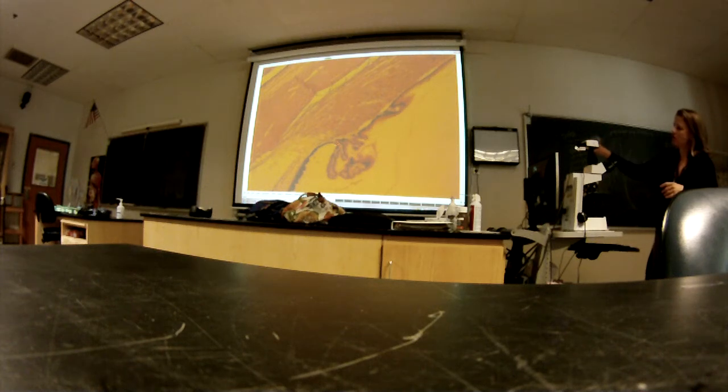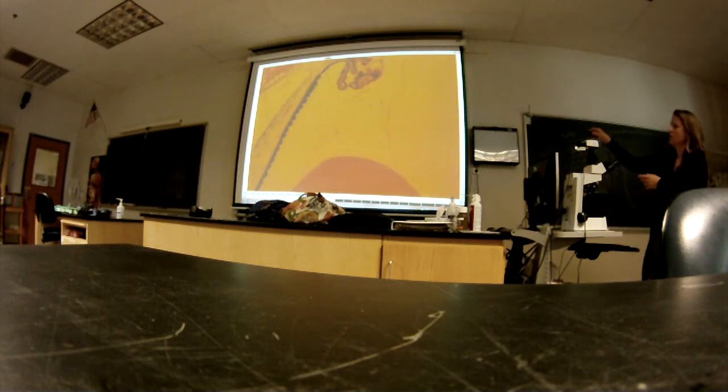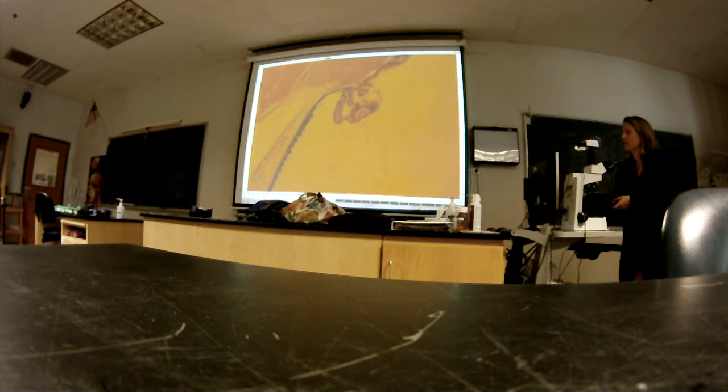See the smooth muscle along with these. These are the ciliary processes. This is where the suspensory ligaments would attach down here to the lens. See where you are? So here's the lens. I know it's hard on this. So are they destroyed in the process? They've been destroyed, yeah.